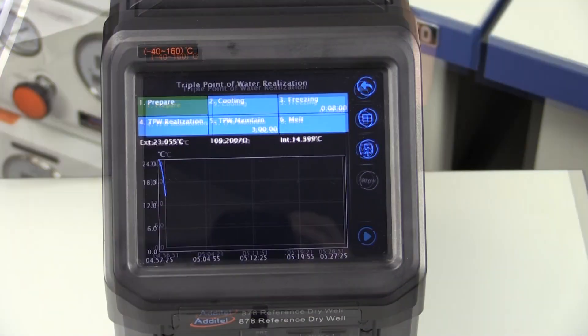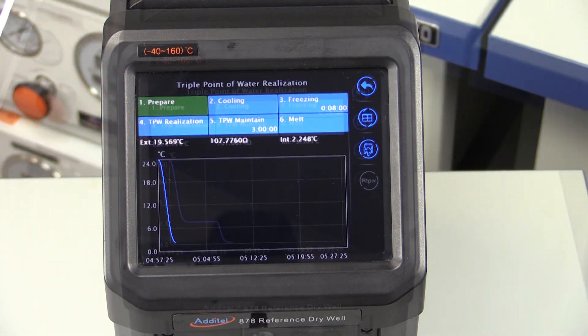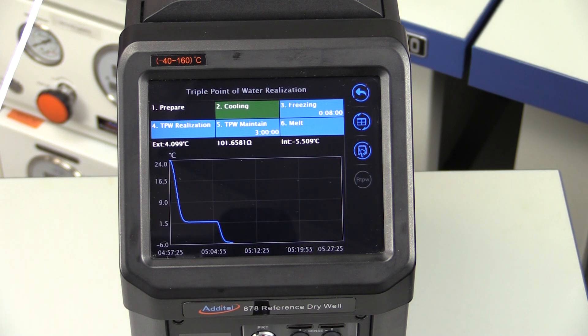The ADT878 will run down to 2 degrees C for 5 minutes to allow for some stabilization. By having the reference thermometer in the cell during the temperature descent, this will help to cool the reference thermometer, which will lengthen the triple point of water's plateau. The ADT878 will then cool to about minus 5.5 degrees C to supercool the triple point of water cell.